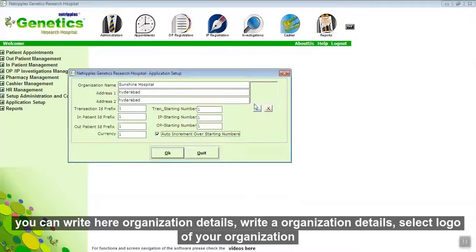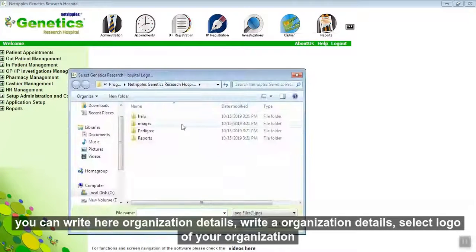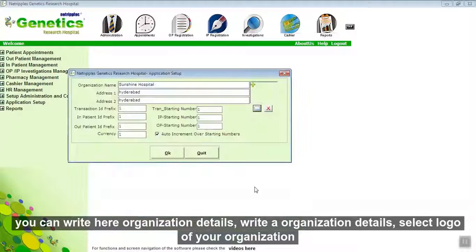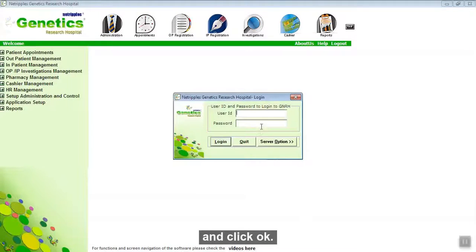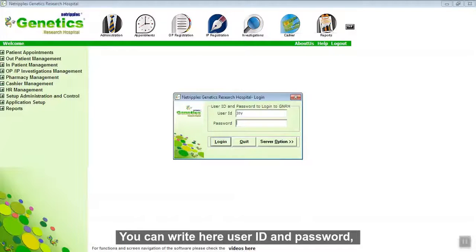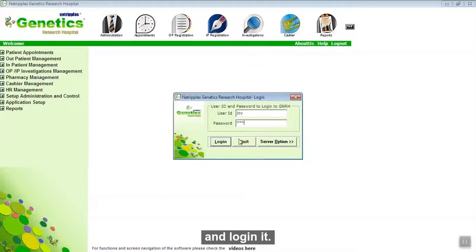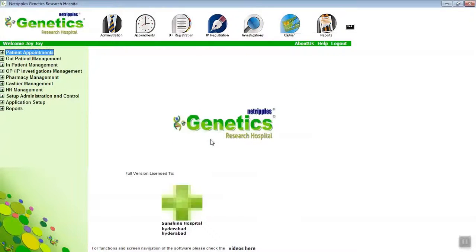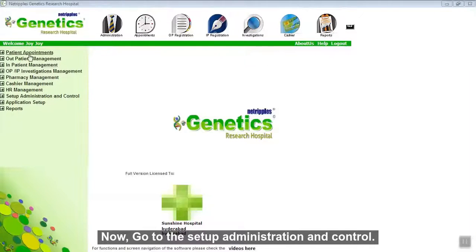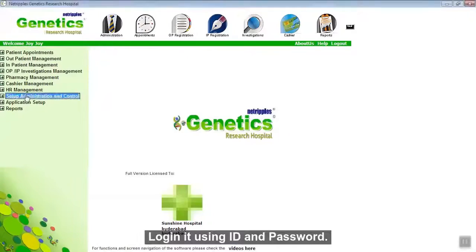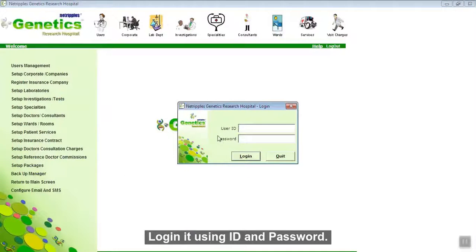You can enter your organization details here. Write the organization details, select the logo of your organization, and click OK. Details are saved. You can then enter your user ID and password and log in. Now go to Setup, Administration and Control, and log in using your ID and password.